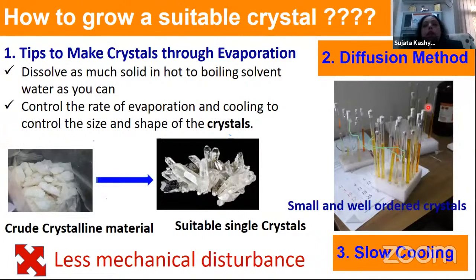We pour the clear transparent solution of our compound into this tube, and then, along the wall of the tube, we add drop by drop the non-polar solvent, or the solvent which is immiscible with the previous solvent. Then we seal the tube with paraffin and prick it to control the rate of the reaction. Here we can see the solution of our compound, and here is the transparent solvent which is immiscible with the previous one.